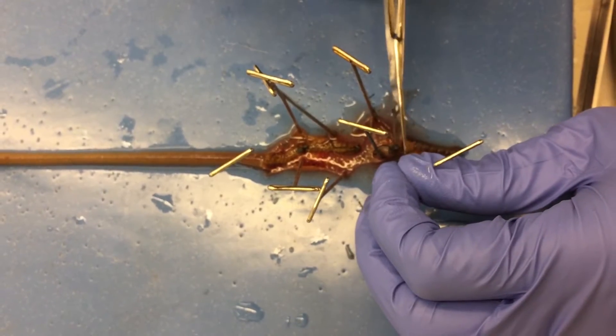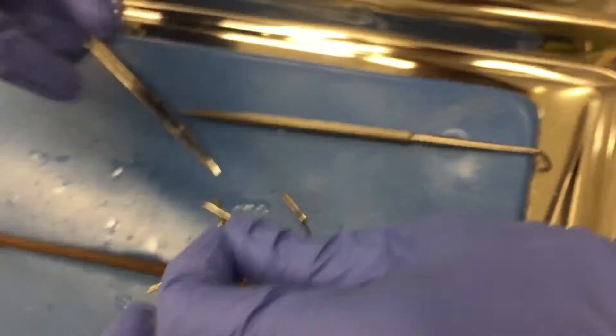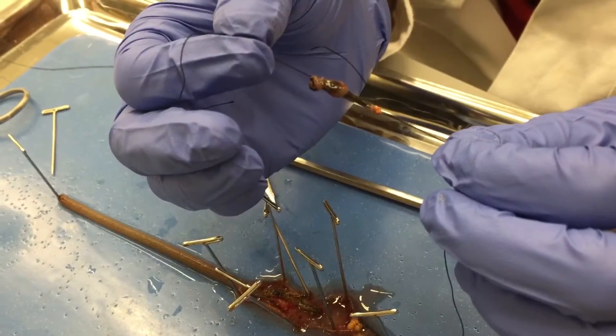Cut the intestine on either side of the suturing string so that you can remove the crop and gizzard from the rest of the worm.